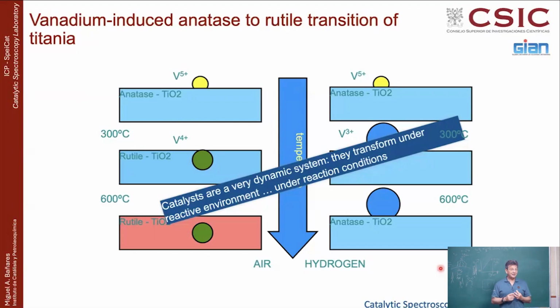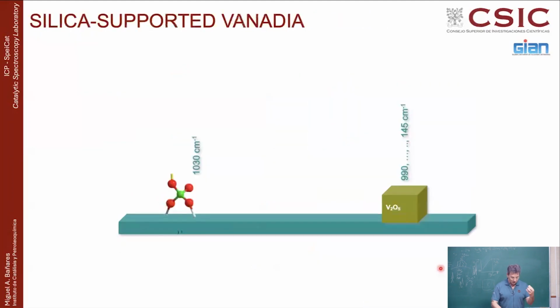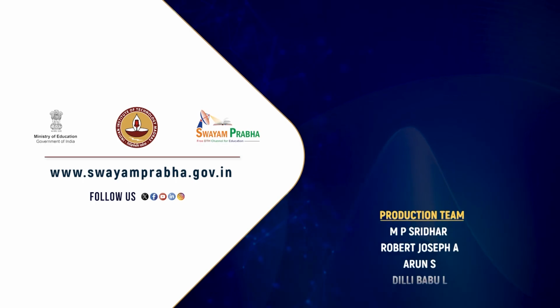But if you heat in catalysis, the catalyst will be working, and there are more chances for structural changes. And that's why the operando study is very important, because the catalyst is a lot more busy. It's not just sitting there looking at the molecules passing by. There's something else. This triggers the reaction. That's why it's so important to get into the real reaction conditions.